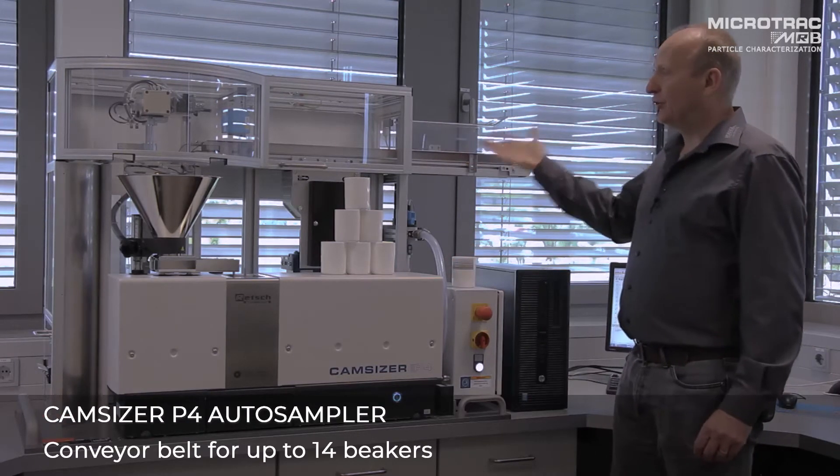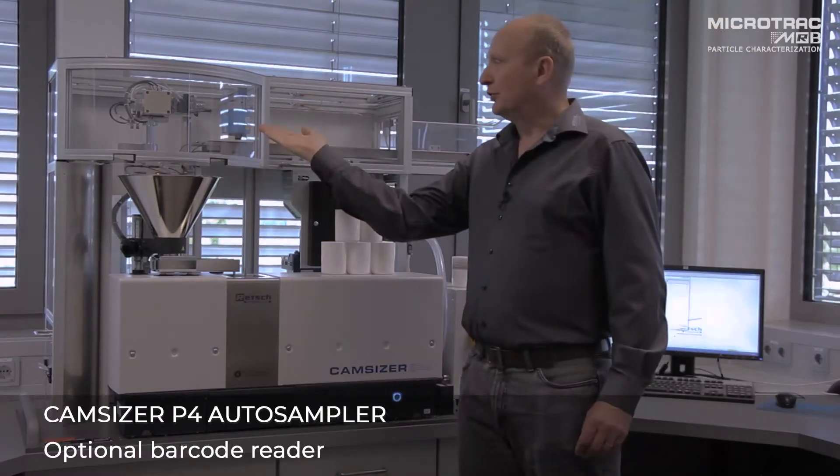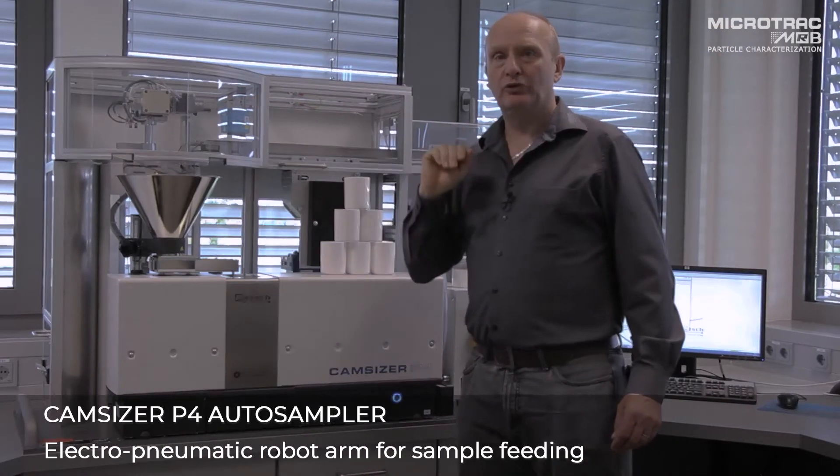We have the conveyor which transports up to 14 beakers, the optional barcode reader and the pneumatic robot which will load the samples.